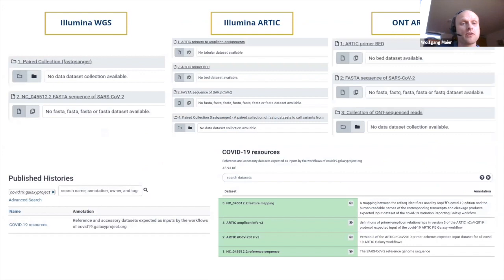What's important is that this complexity of the workflow is not really exposed to the end user. So what we decided for is to give the user at this first level really almost no control over what gets reported. I discussed this. If you give the user too much freedom, then different analyses tend to get incomparable because some filtered away certain variants, others didn't. And you really cannot say something's absent here and present there because you don't know what got filtered out. So at these analysis workflow steps, we're really not filtering as much as possible.